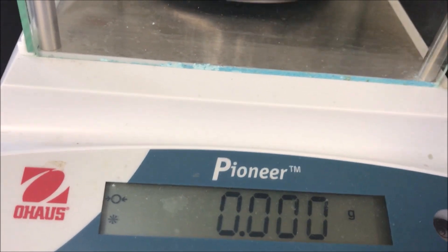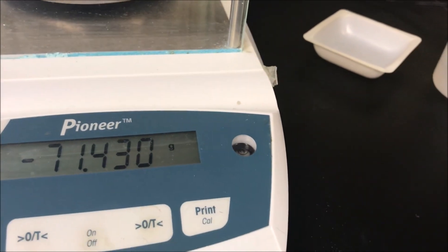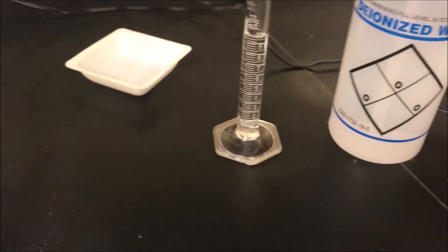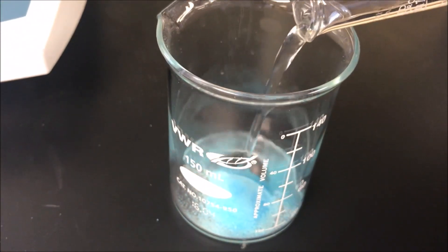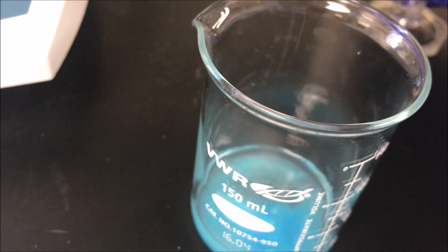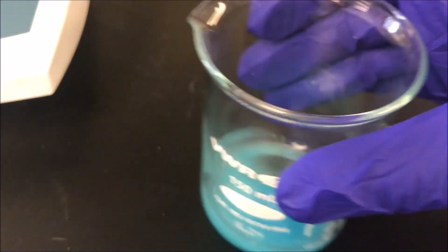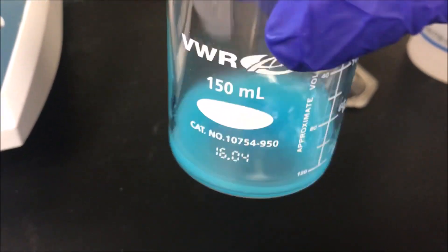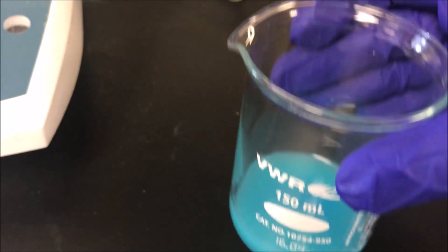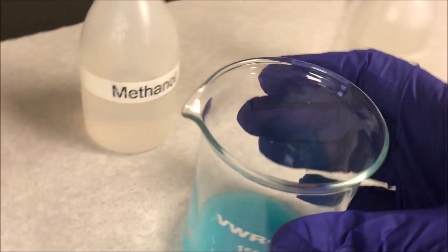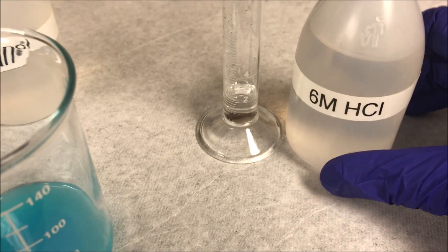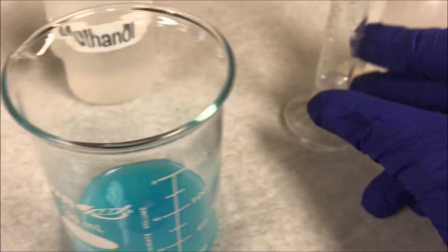Now take out the beaker and add 10 ml of deionized water. You will get a blue solution. To this solution, add 2 ml of 6 molar hydrochloric acid.